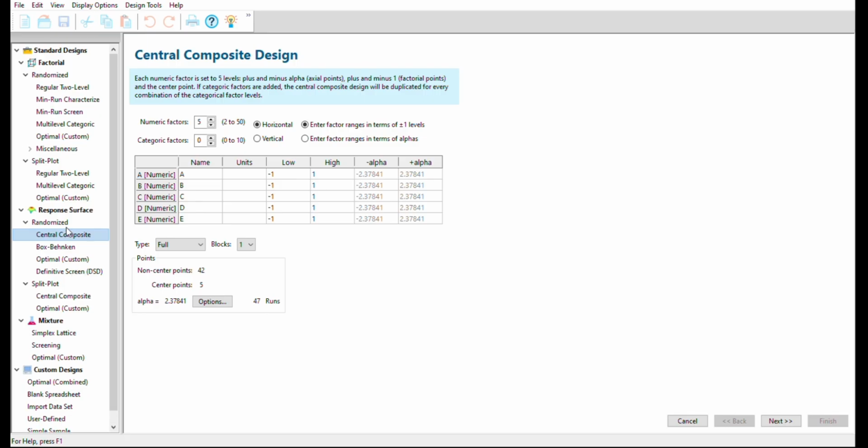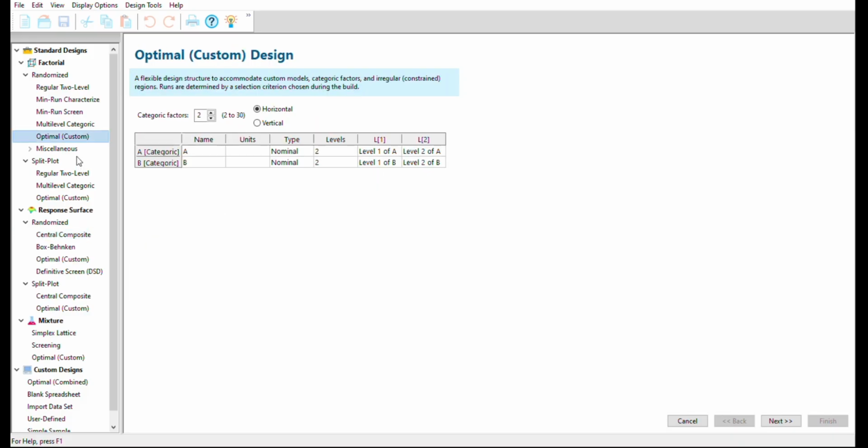In some cases, for example in today's immediate release dosage formulation design, we'll use optimal design. I have a separate video on each of the designs. Whatever your design is, the statistical analysis and the optimization are much more similar for each design. Now we'll see how we can optimize and design a formulation using this Design Expert software.